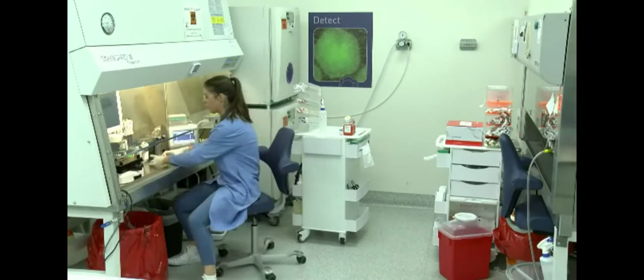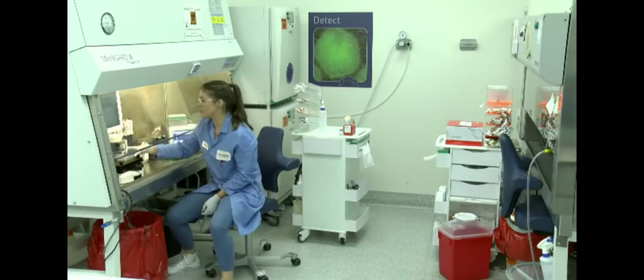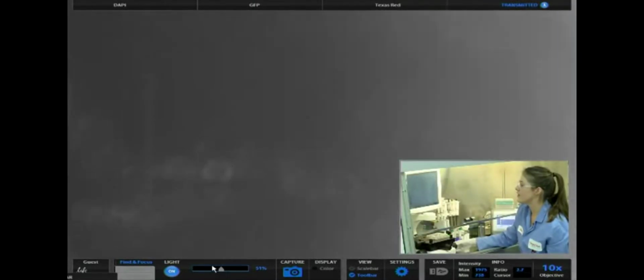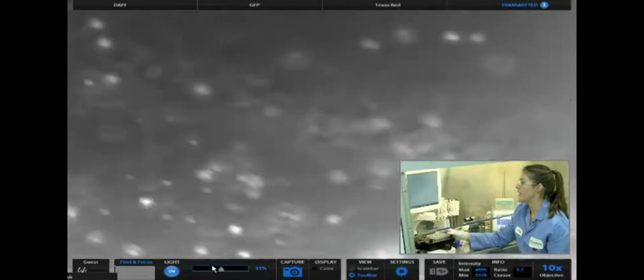And then you can rock your plate back and forth a little bit to make sure that the cells are evenly distributed throughout the well. And then I can show you on the microscope what the cells will look like immediately after electroporation. So you can see the cells floating around in there. This is just to give you an idea of what it looks like immediately after transfection.